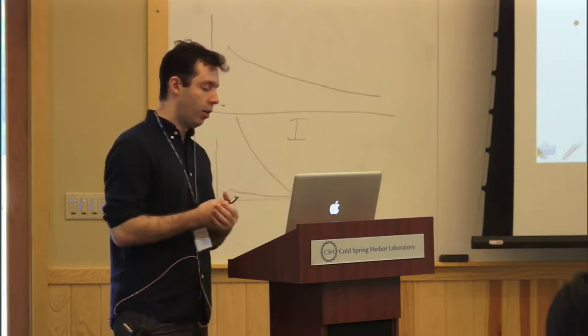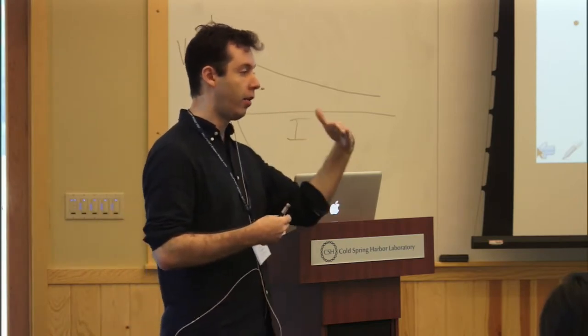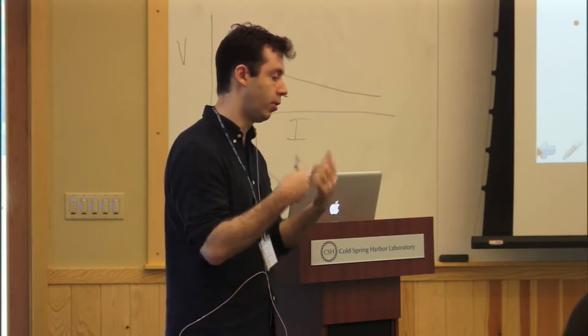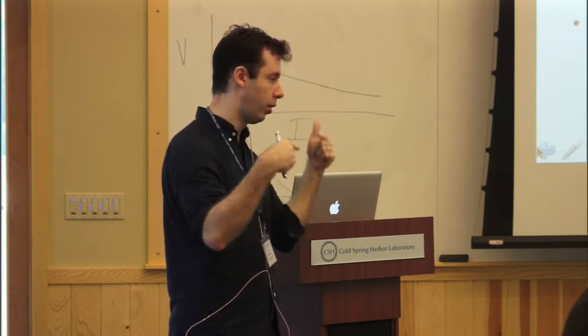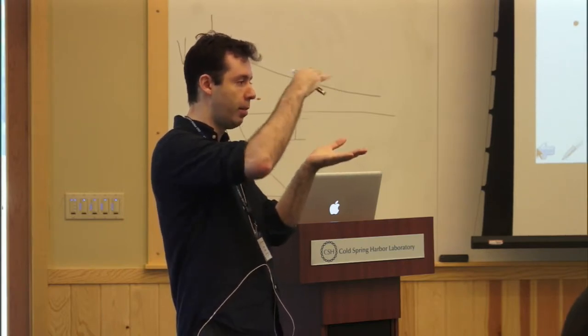Obviously, if you're sequencing a human genome and you want to get high coverage, you need to sequence more. You need to sequence longer reads. So that's the situation where you want to do paired end, 100 base pair or 200 base pair long reads. You can really maximize the coverage so that each nucleotide is covered by many, many reads.